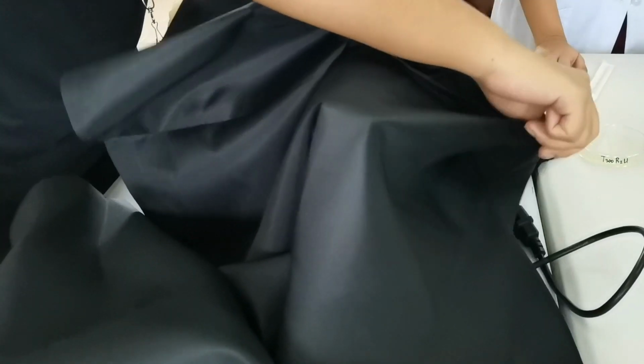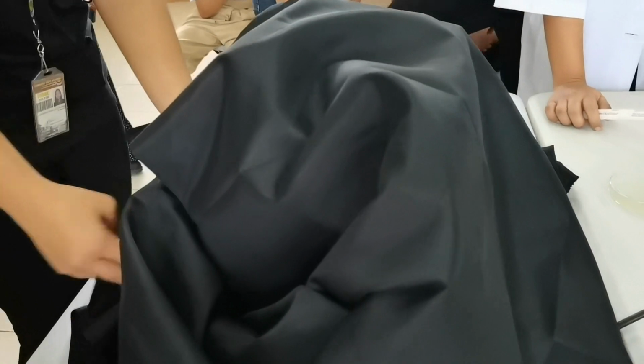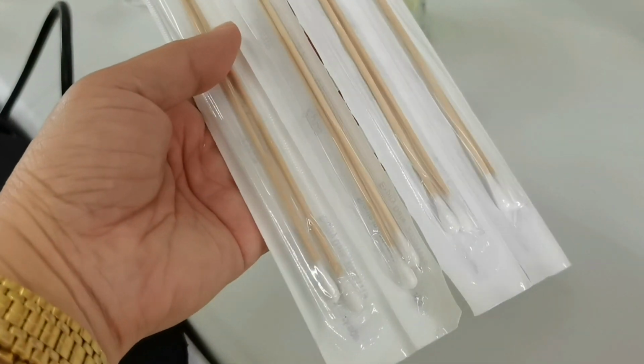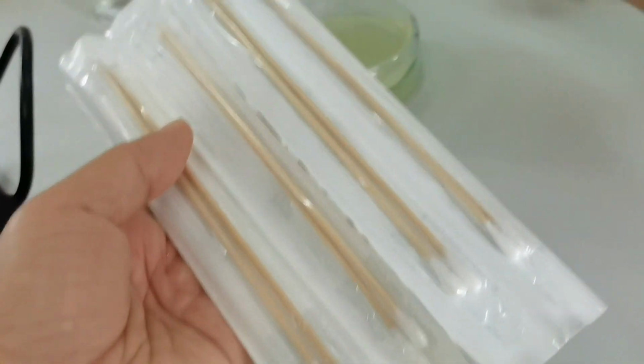After inoculation, they expose the plates to UV light, shortwave UV, in this box. And this is the cotton swab that they use for inoculating the plates.